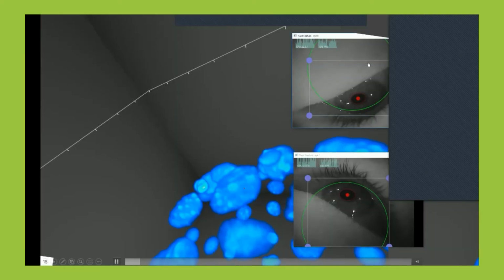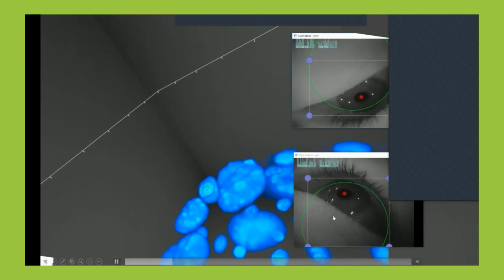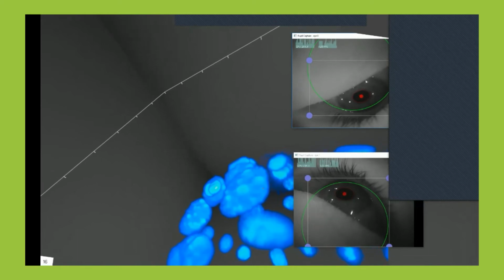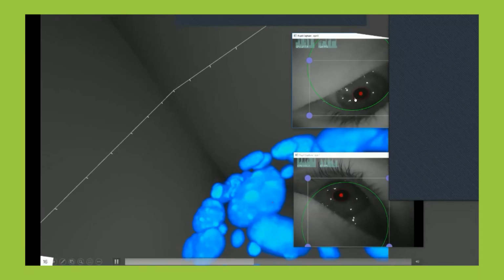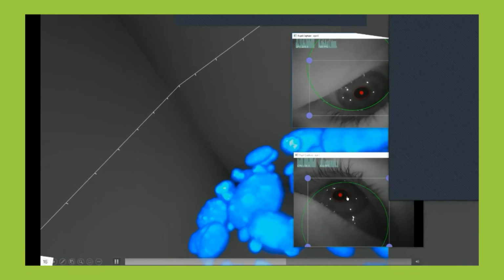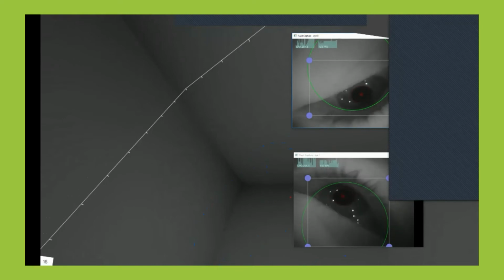So here we have, these are actually my eyes here, and I'm tracking a cell in this data set. And you see maybe a little red dot in about the center of the screen. This little red dot indicates where I'm looking. And you can see that the eye tracking cameras have locked onto my pupils, so they are able to quite reliably make a determination of what I've been looking at.